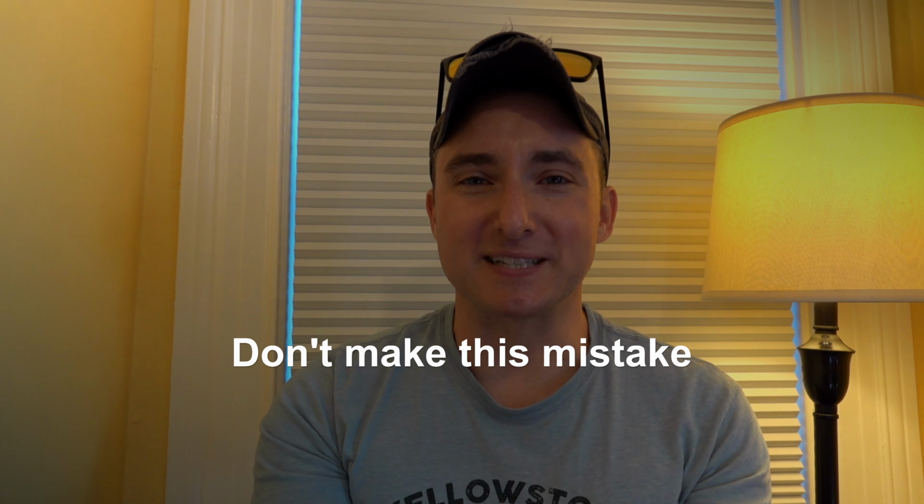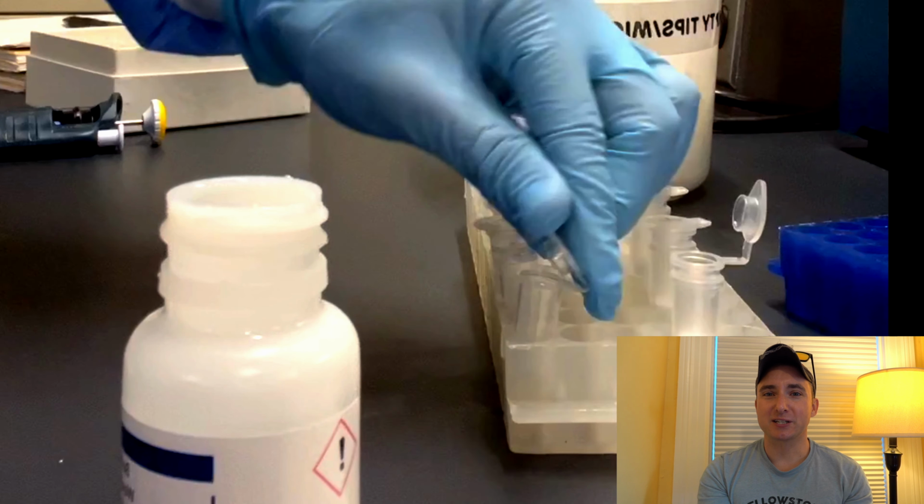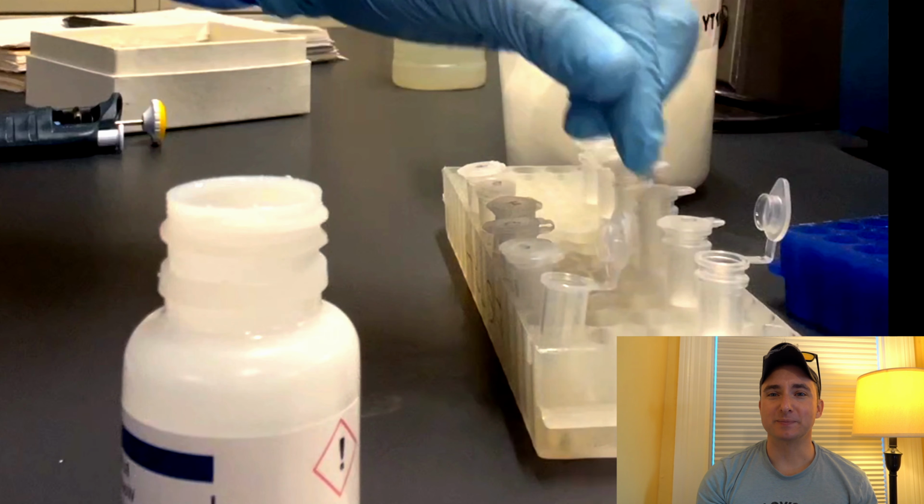One of the things that I see people do all the time, whether they're new in a lab or experienced and just trying to show how fast they can go, is flick that lid off and it makes that popping sound, and that popping sound feels so satisfying. But what it's also doing is creating air currents and little droplets of liquid that are flying all over your bench space and potentially going to contaminate things, getting on your gloves and so on. You can do this with 2 hands, the way we're seeing in one video, or you can use a test tube rack on the bench to provide you with some grip so that you can open the tube lid carefully that way.